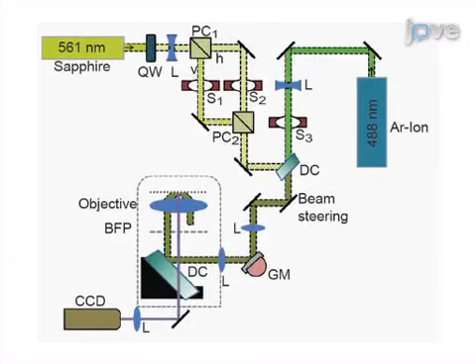The second step is to verify that the P and S beams are collinear, pass through the optical axis of the microscope, and illuminate the same portion of the viewing field when in total internal reflection fluorescence, or pTIRFM.